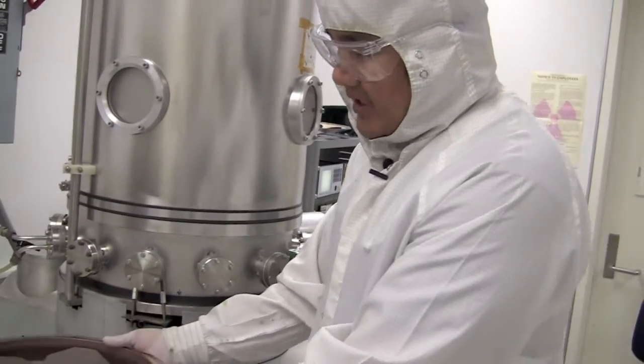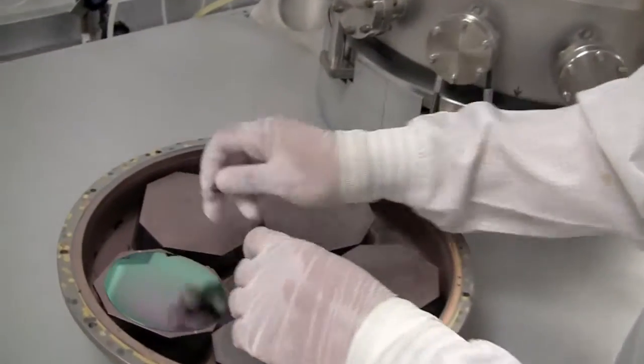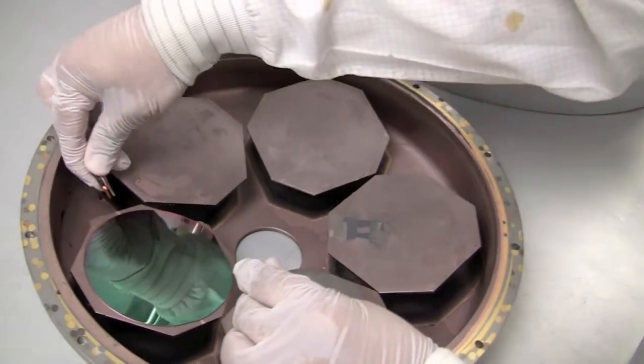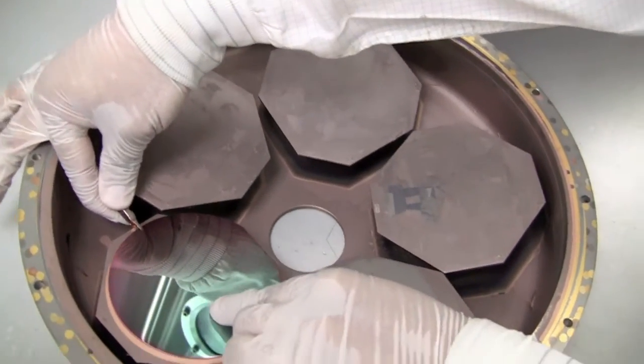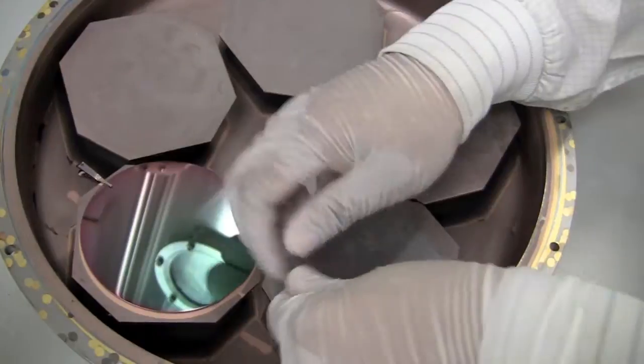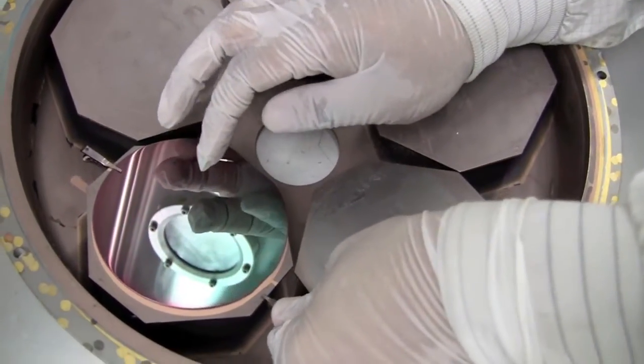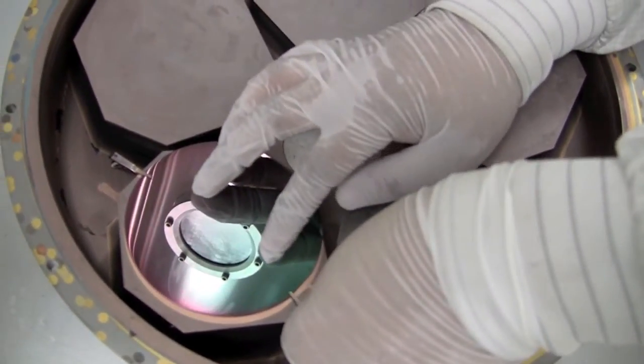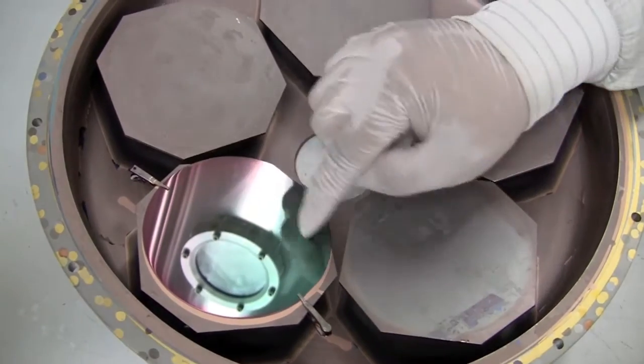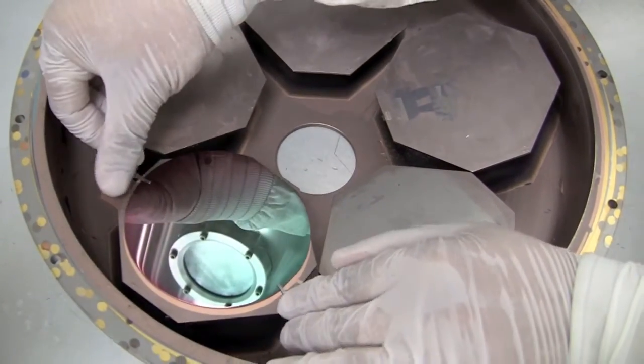So if you look at this sample holder, we put the wafer on here and we're going to clip it onto here because actually this whole thing is inverted in the machine so you don't want the sample to fall. I use clips, but you can also use thermal Kapton tape.